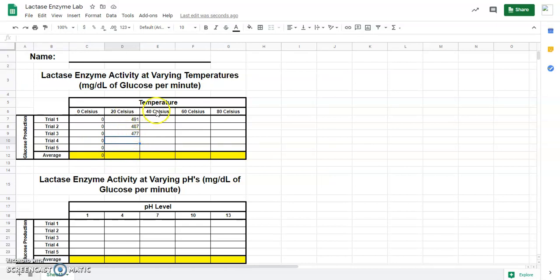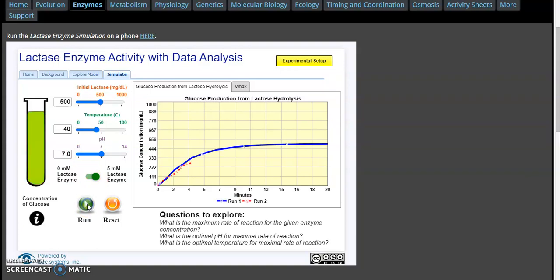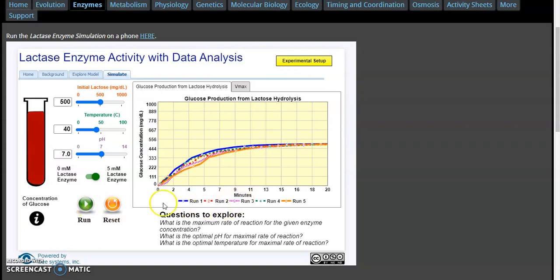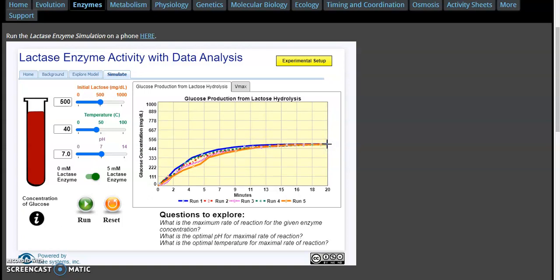Now we're going to do 40 degrees Celsius. Each time we hit run, it's simulating a 20-minute trial. After 20 minutes, run 1 was 498 — put that in trial 1 for 40 degrees Celsius. Trial 2 at 40 degrees Celsius is 497. Trial 3 is 494. Trial 4 is 492. Trial 5 is 494.